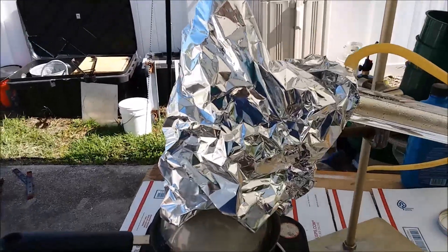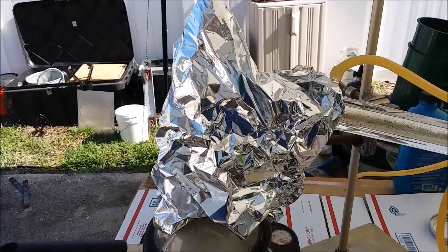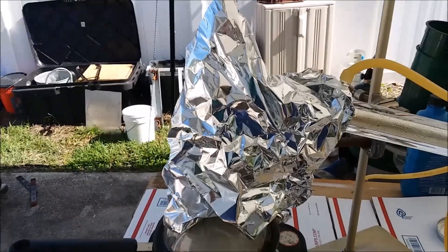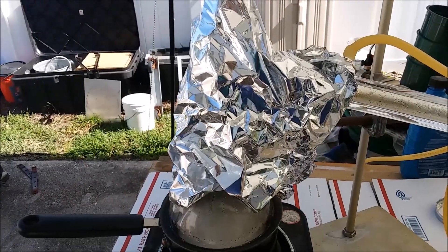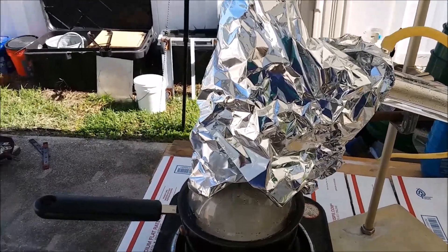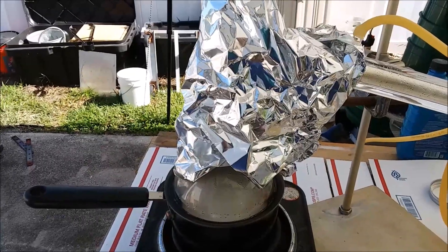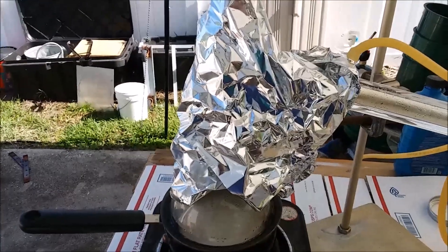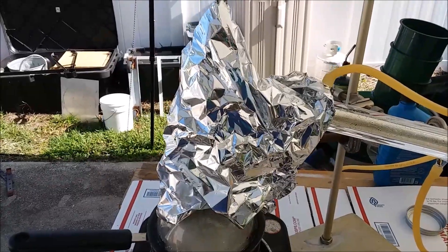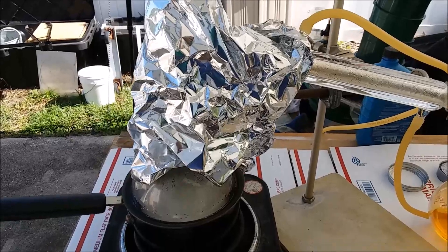I do have the top of the flask and the beginning of the condenser better insulated than before, because I could see I was just refluxing a lot up there and the vapor was condensing and running right back down into the flask. So I thought if I could keep the top of the thermometer section warmer, the vapor might go directly into the condenser and condense. So that might be what's going on.